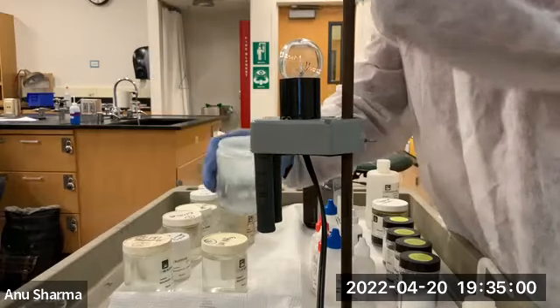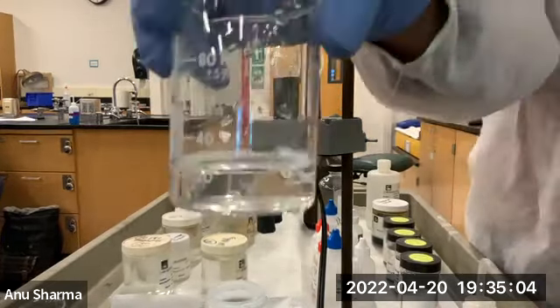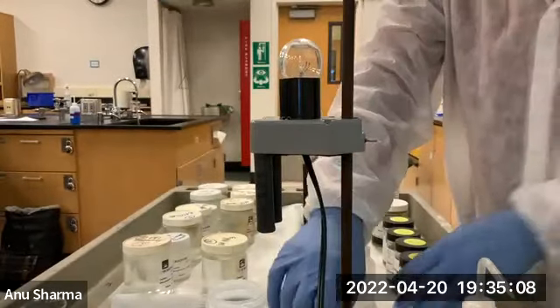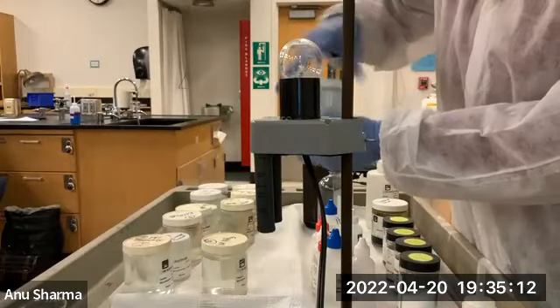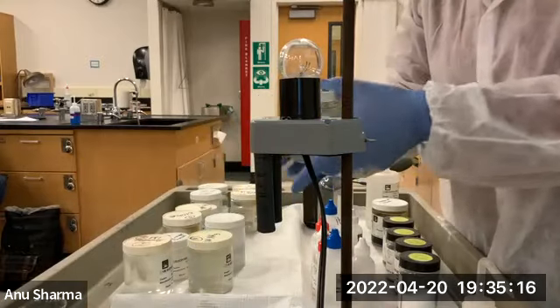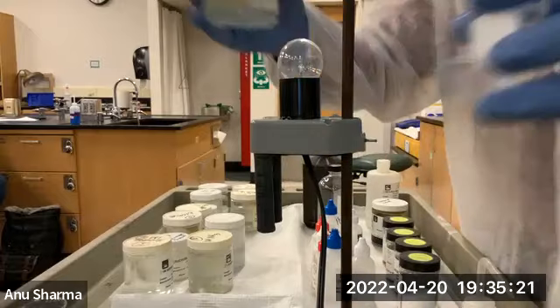It's still a clear solution, barium hydroxide. Okay, now turning it off and then bringing in sulfuric acid. All right, sulfuric acid and barium hydroxide.